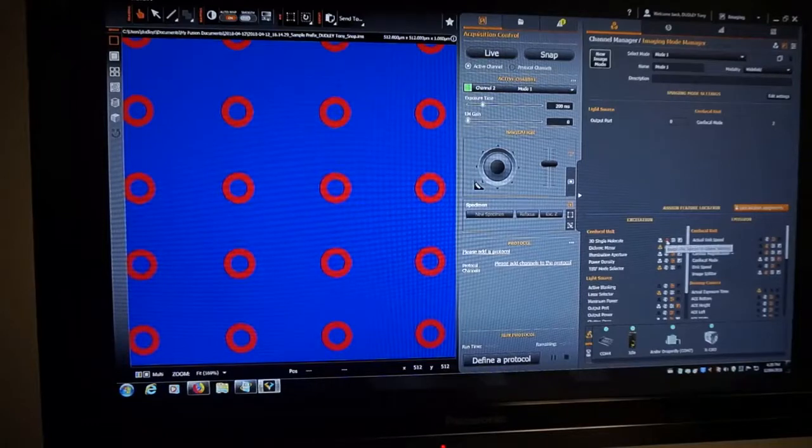The little globe means I want it to be a global feature. The three bars with the sliders mean I want it to be an advanced setting, and we'll get to that in a moment. Or I can make it part of the imaging mode. Okay, so you have tremendous freedom to set what these things are.